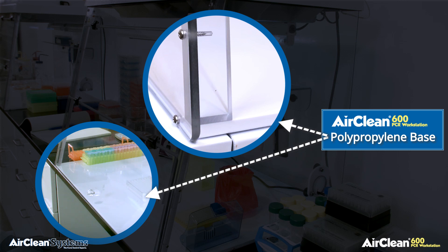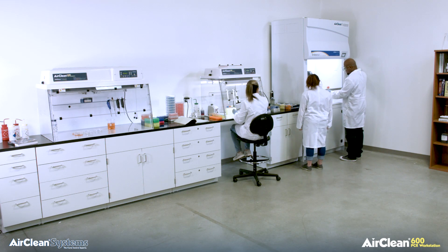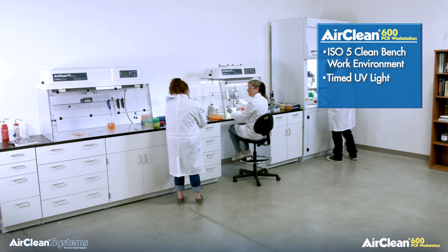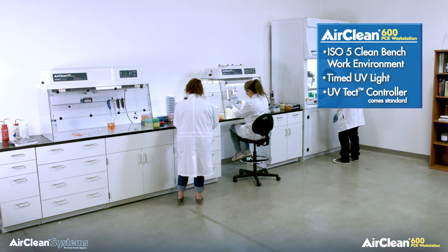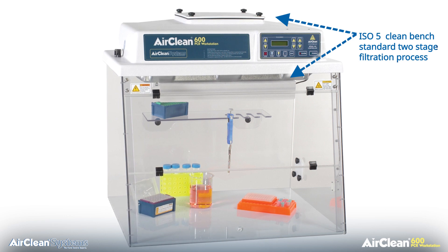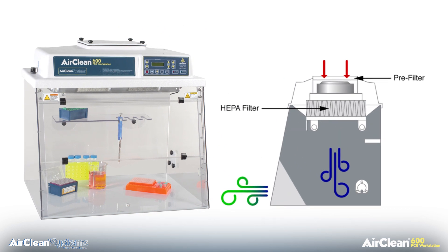The base has a smooth front lip to provide added comfort for the operator during hours of pipetting. AirClean Systems Combination PCR workstations are truly designed with the application and operator in mind. The workstation provides an ISO 5 clean bench work environment with timed UV light for sterilization, utilizing a two-stage filtration process with both a pre-filter and HEPA filter to achieve ISO 5 classification. It should be noted that the Combination PCR workstation should not be used with any potentially harmful biological matter.